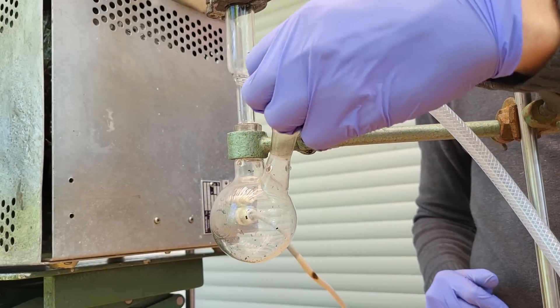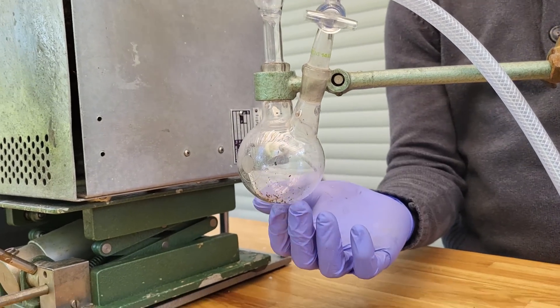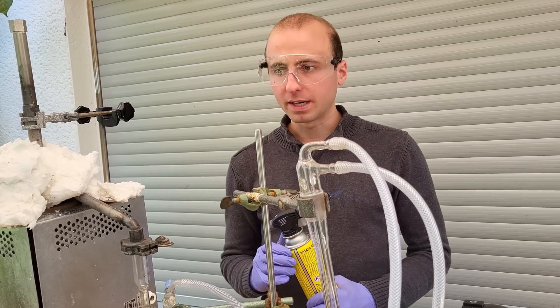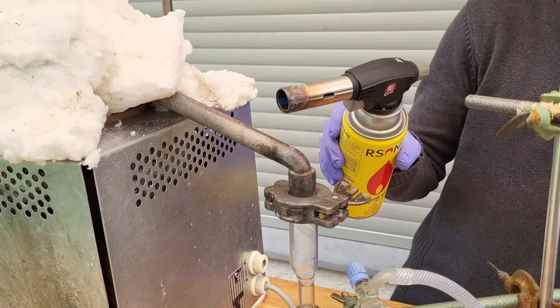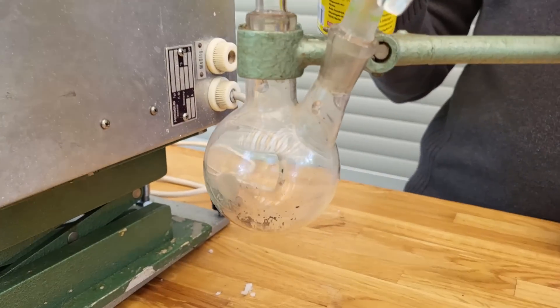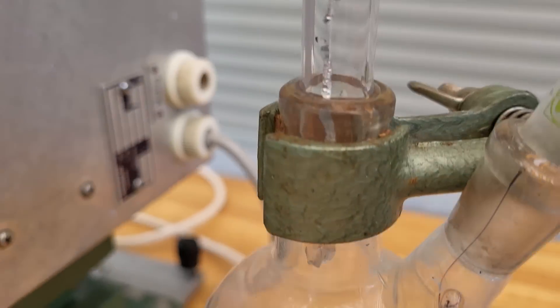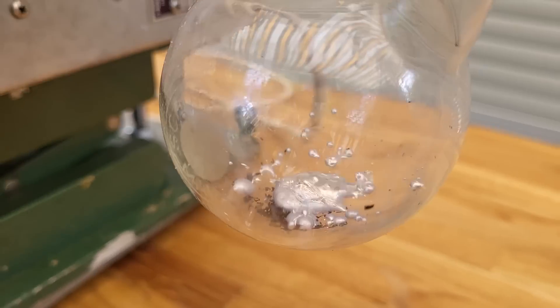There's a little bit of black stuff in here but it should be fine. We need to set this to maximum temperature: 900 degrees Celsius. Now we are at the temperature where potassium metal should definitely be distilling over, but nothing has come over yet, so we're going to try and heat the cooler right here and hopefully should observe something coming over.